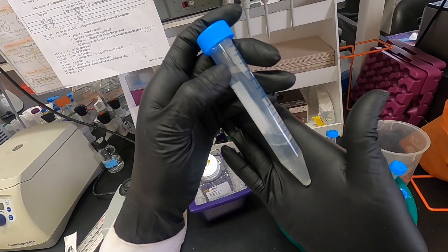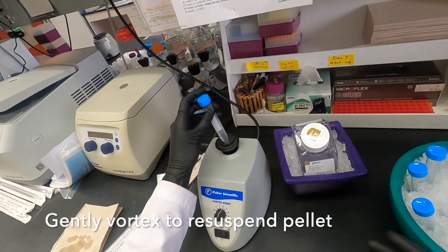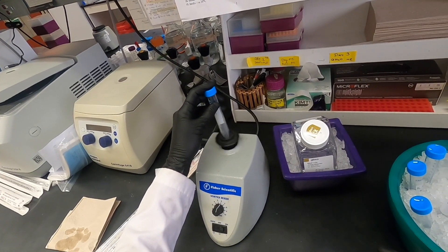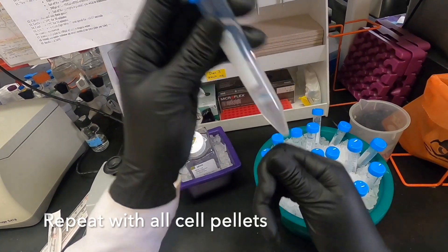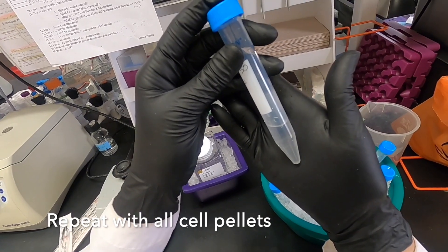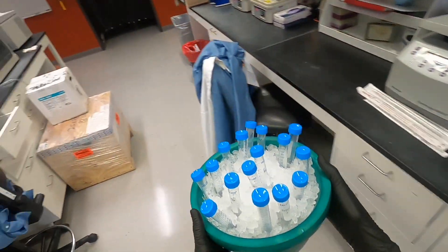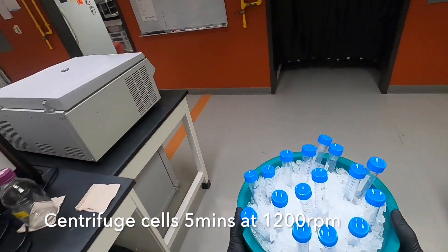As you can see from the bottom of the tube, we have not resuspended our pellet. We will now do so by gently vortexing the cells. We can also resuspend by pipetting up and down several times. This is followed by another centrifugation step.